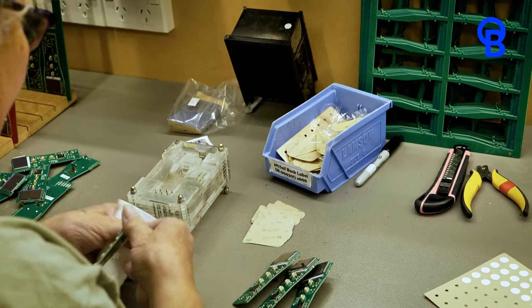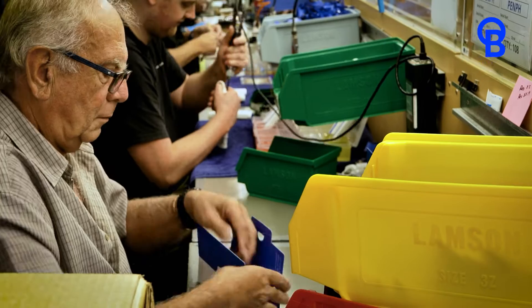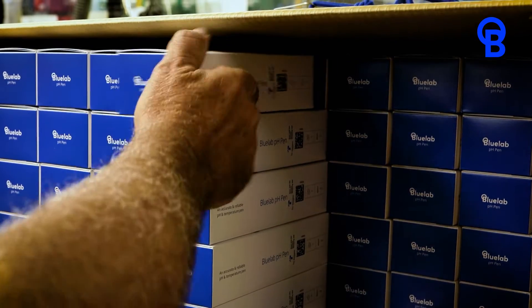Our Bluelab PH Pens are designed, manufactured, and tested at our headquarters in New Zealand. That's how we back our pens with our one-year limited warranty. Thanks for your time — I hope you enjoy using your Bluelab PH Pen. I'm Tua from Bluelab.